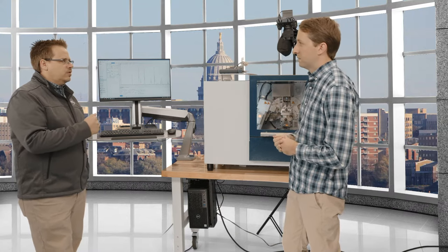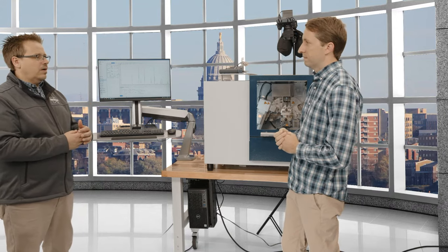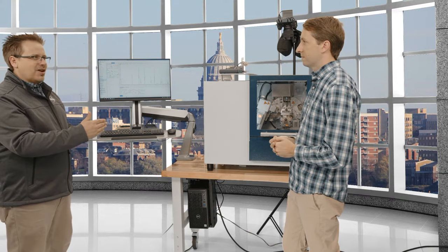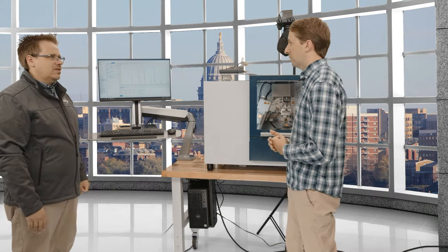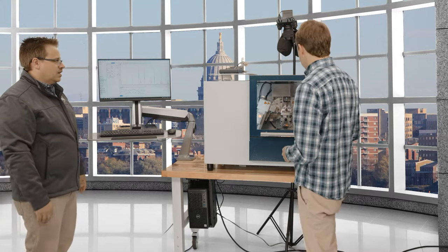And what that allows you to do is have the optimized slit size for every angle in your scan. Now, since we're talking a small radius, though, and the samples are fairly big, how can we actually open the slit enough to cover that whole angular range and maintain a linear opening? You absolutely can. Of course, it depends on the size of your sample. Why don't we do one and check it out.